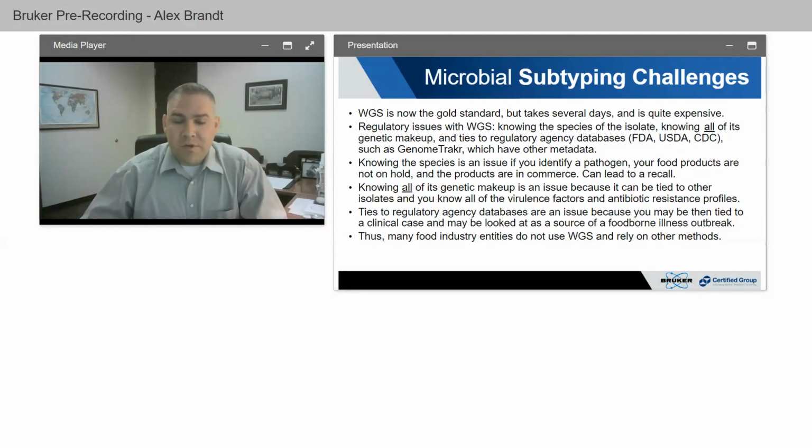Knowing the species is also an issue if you identify a pathogen. So your food products may not be on hold, they may be in commerce, and if you identify a pathogen through your subtyping method, that could lead to a recall. In addition, knowing all of its genetic makeup is also an issue because it can be tied to other isolates, and you know all of the virulence factors and antibiotic resistance profiles. And then if you can, as I mentioned, get tied to a regulatory agency database with metadata in a clinical case, you may be looked at as the source of a foodborne illness outbreak.